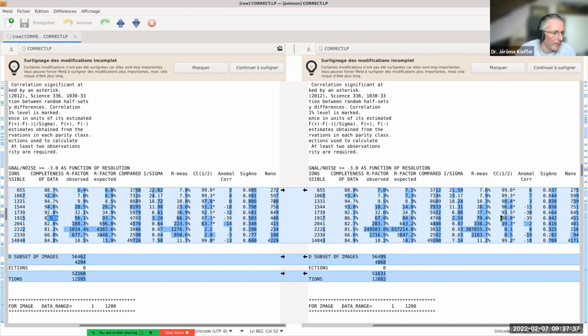And Nicola did some further investigation on the reconstructed volume, or the reconstructed electron density. Maybe you can comment a bit on this, Nicola. Yeah, I'm sorry, I don't have the images right there, but looking at FOFO maps, for example, the signal was still there. Of course, the idea now is to reproduce that with still images, and that's what we're going to do.